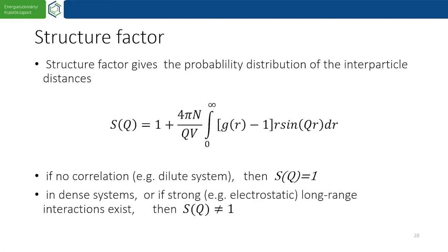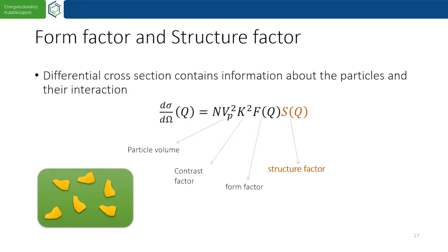But you're talking about concentration for liquid samples. If you have a solid sample, then it's not so easy. For solid samples, it's actually not possible, but usually solid samples are not of this type. They are not of the form factor, structure factor type. Okay. Well, mine are, but never mind. Okay. Thank you.